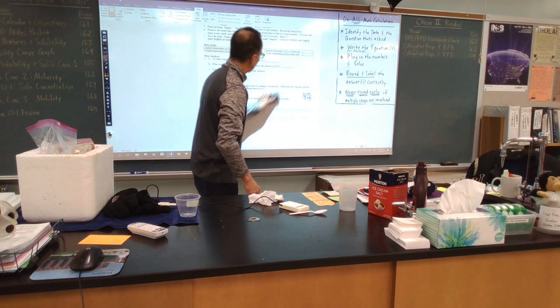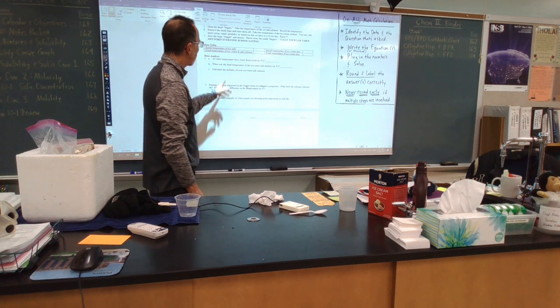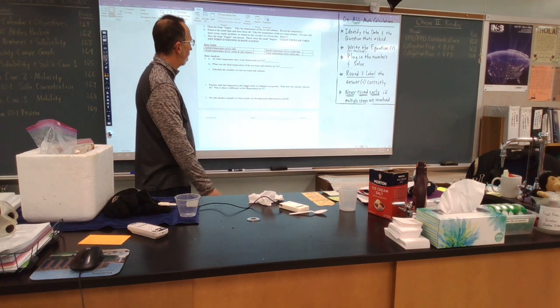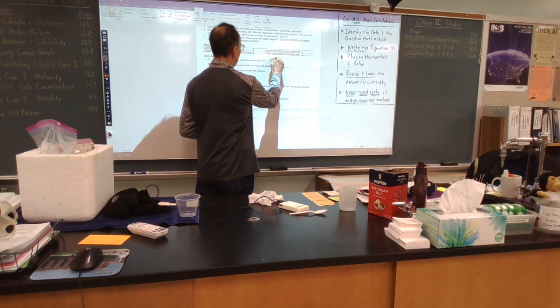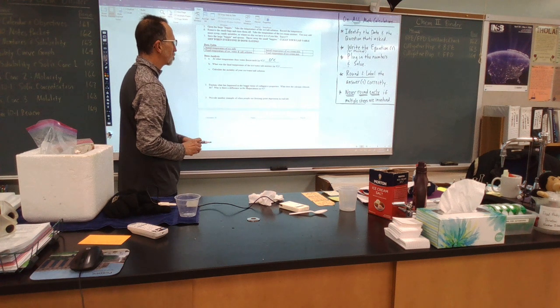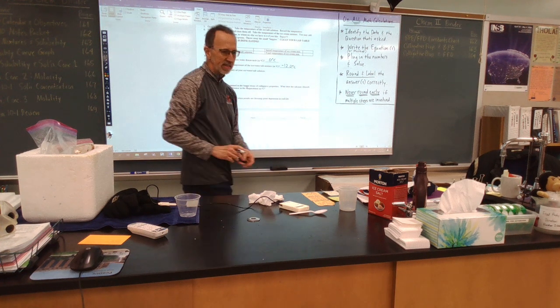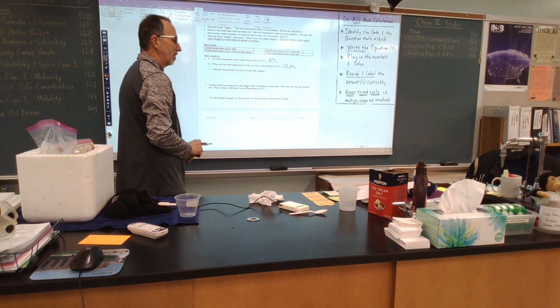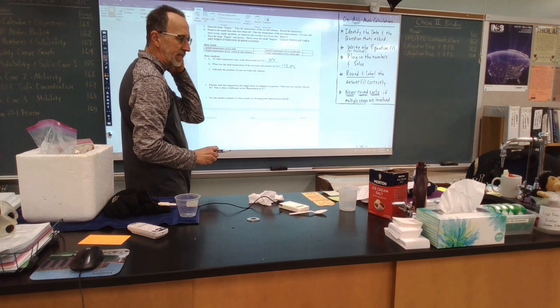Okay, now, so first of all, at what temperature does water normally freeze or ice normally melt? And of course, that would be 0 Celsius. What was the final temperature of our ice and water salt mixture? That ended up being minus 12.0 degrees Celsius. So you can see then that the change in the freezing point would be 0 minus negative 12.0, or 12.0 degrees Celsius.